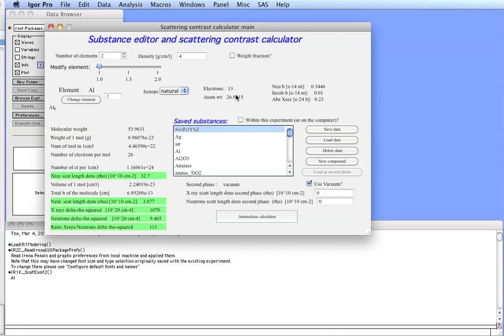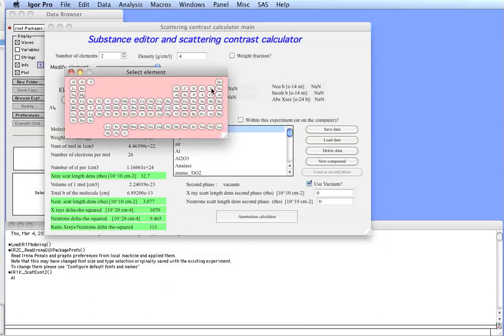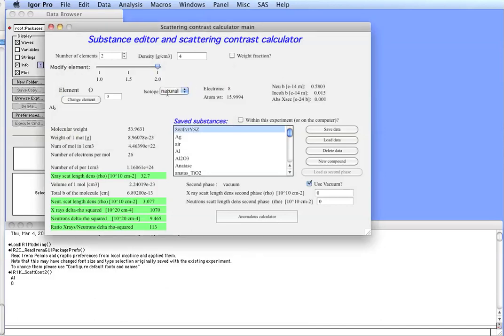Isotope is important for neutrons only. Now, we can go back and here slide to number two and change that as oxygen. Al2O3 is oxygen here.